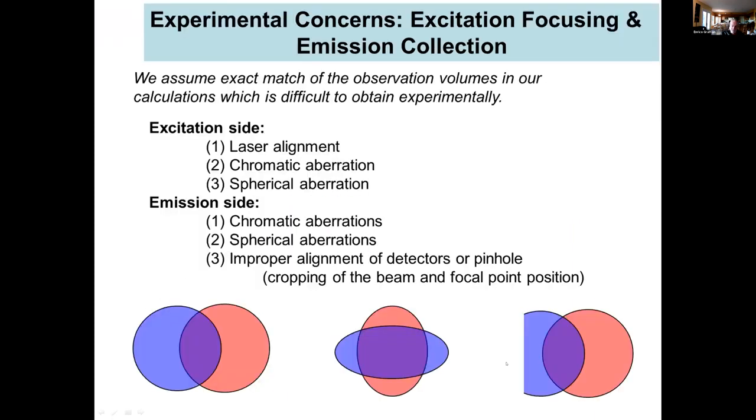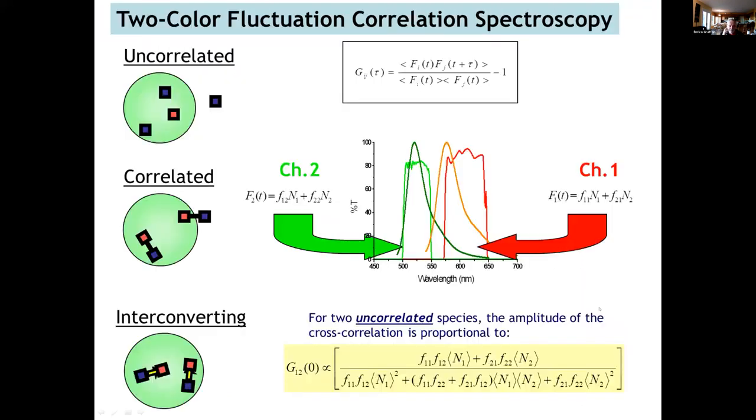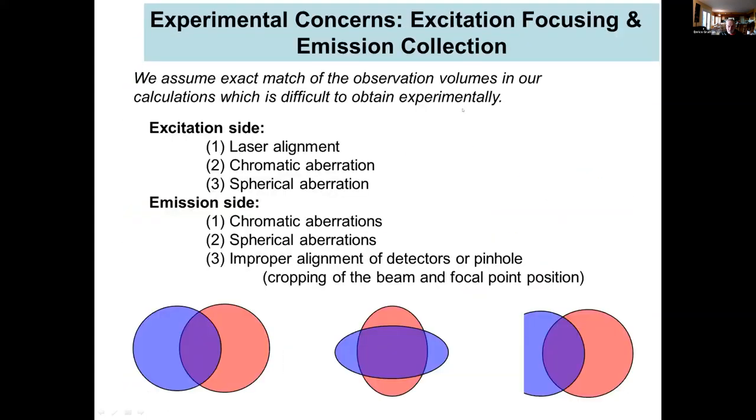And so the cross-correlation experiment is a little bit more complicated because, of course, the volume of the green and the volume of the red do not necessarily superimpose, and there are many different things. And the filters that you use don't separate the molecules completely. For example, the red filter lets pass a part of the green. So you have to take that into account. And we know how that is done, etc.